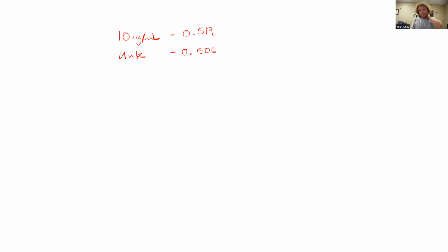And I think what I would want to do is empty out the cuvette from my unknown and repeat this maybe two more times. That means empty out the cuvette, add 900 microliters of the Bradford reagent, add 100 microliters of that unknown, and get the measurement for that unknown's absorbance a total of 3 times. That doesn't mean put the cuvette in, press read, wait, read, wait, read again. That's not what I'm looking for. I'm looking for making that solution all over again.